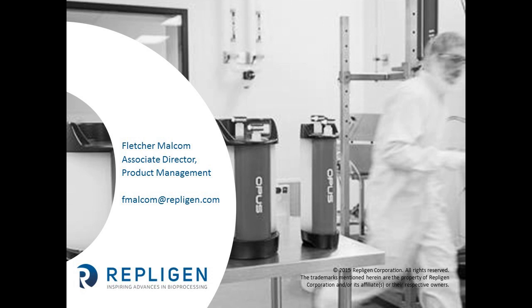From an end user perspective, the most somebody has run a column is a 45 centimeter column packed with a protein A resin, and it has seen 25 cycles of clarified harvest, and it's still working well. So we've had good success with reuse. It is a good question, and if you're still concerned with it, it's something that you could actually model on a small scale.